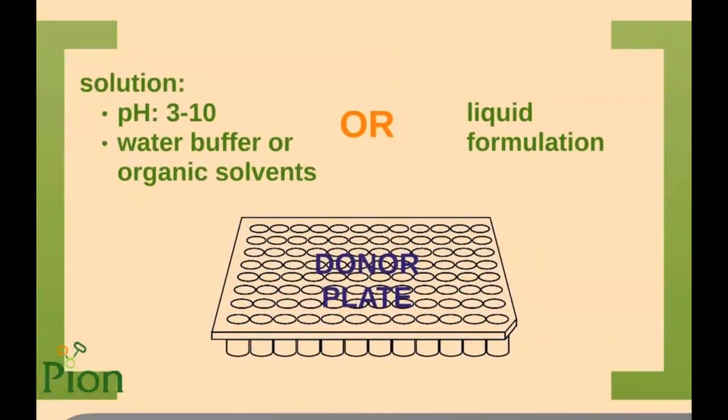The next step is preparation of the donor plate. When working with solutions, pH can vary in a range from 3 to 10. Pure water buffers, co-solvents, or pure organic solvents are also possible. Liquid formulations can be applied as they are without any further dilution. The donor plate volume is 200 µL, but as the stirring disks have a volume of 20 µL, we should add 180 µL of solution or liquid formulation into every single well.